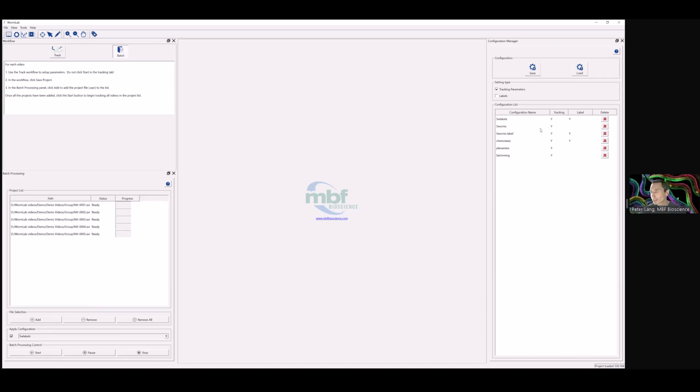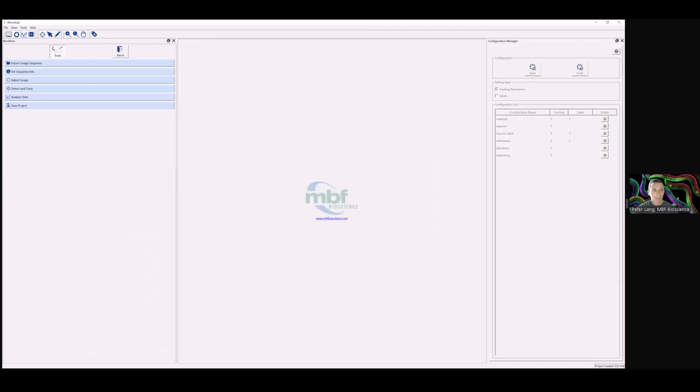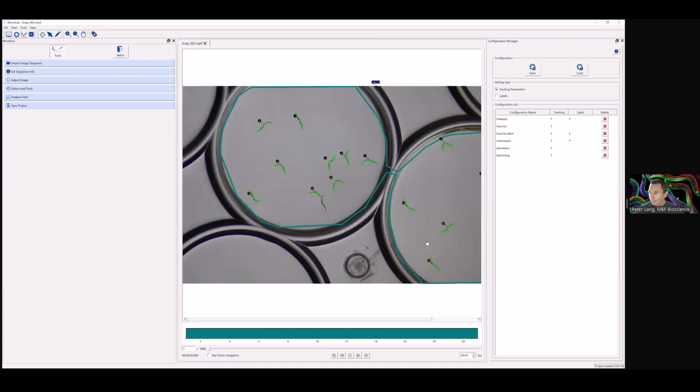What you can do with this configuration manager is, here, I'll load in a video here. Okay.